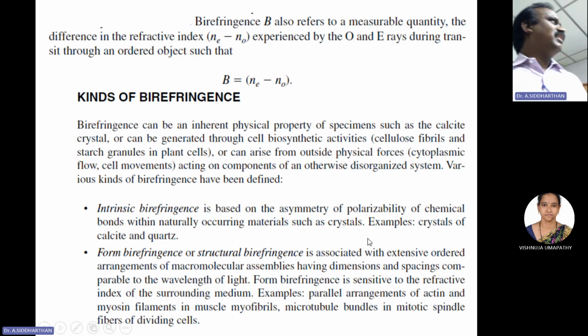So what is governing these different paths is actually the dielectric constant of the material. In a certain direction, it is allowing light to go at the same speed. In a certain direction, it is not allowing it to go at the same speed. It goes faster. Okay, so this type of birefringence is nothing but two different paths going out after the light goes through. This birefringence can be a characteristic of a material by itself, or it can be introduced in the material by external means.